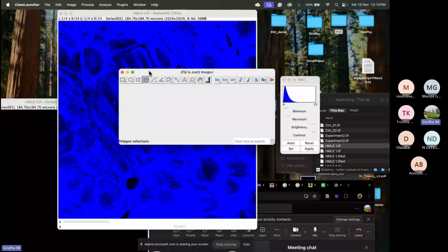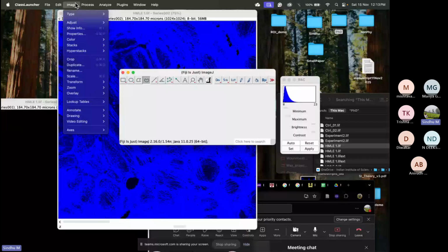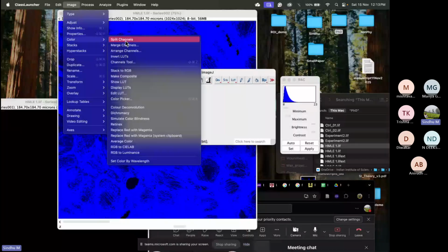And yeah, one more thing you can do is, instead of every time you have to... FIJI is a very click-based software. Like you just have to move your mouse a lot. One way to deal with this is you can set shortcut keys for each of the functions. Maybe that we can do in the next class, where we also talk about plugins and macros and how to make things easier or faster to work with FIJI.